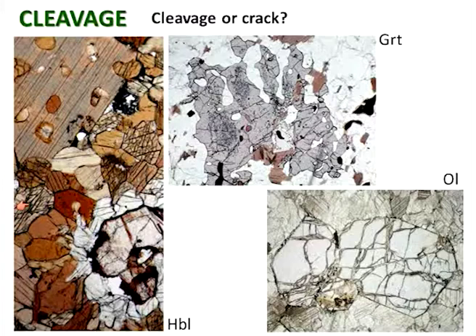So these are cleavage. They're very clear cleavage in this case. These parallel lines up in the top large crystal are fine lines, and they're all parallel to each other. In the other, smaller sections, where you've got two sets of lines, those are mostly cleavage. In this one here they run northeast-southwest, and then two or three lines run at about 120 degrees to that, more or less horizontally across the crystal. So in these sections in the middle of that view, you've got two or three sections of the hornblende which show the very typical amphibole basal cleavage, so two sets of cleavage planes.